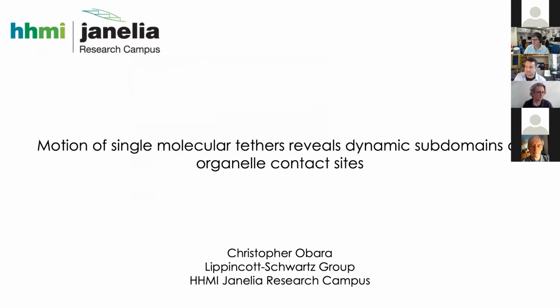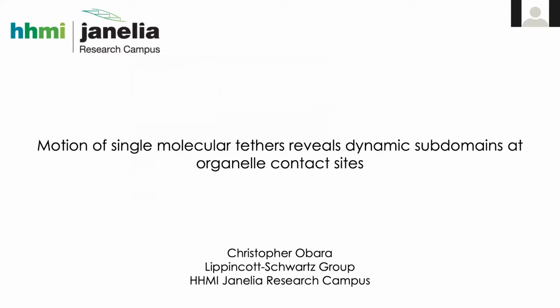I know that the more conventional way to give a talk in this forum is to introduce a new technology and walk through the benefits of that technology. But I want to try to do something a little bit non-canonical today, which is tell you about a story that we've been working on. It's one of a few we've been doing in parallel, where we've tried to iterate back and forth between the advantages of high resolution but low specificity electron microscopy and the high specificity and dynamic nature of single molecule tracking. And by going back and forth between these two tools, we've been able to parse something about a biological system that was previously inaccessible to us.